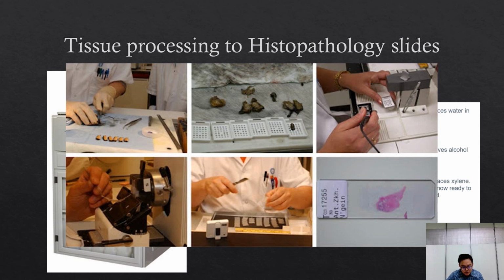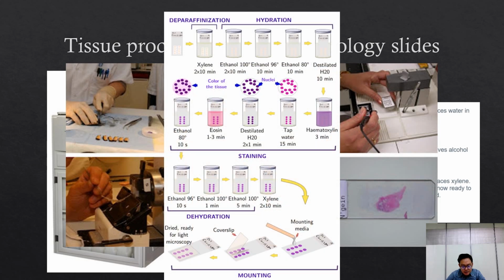These tissue slides are put into an automated stain machine and stained with hematoxylin and eosin stain. The staining steps are shown in this picture, which is the basic stain we use for looking at all tissues initially. Finally, put the mounting medium on the slide and cover it with the coverslip. Then we get the stained slides ready to go to the pathologist.